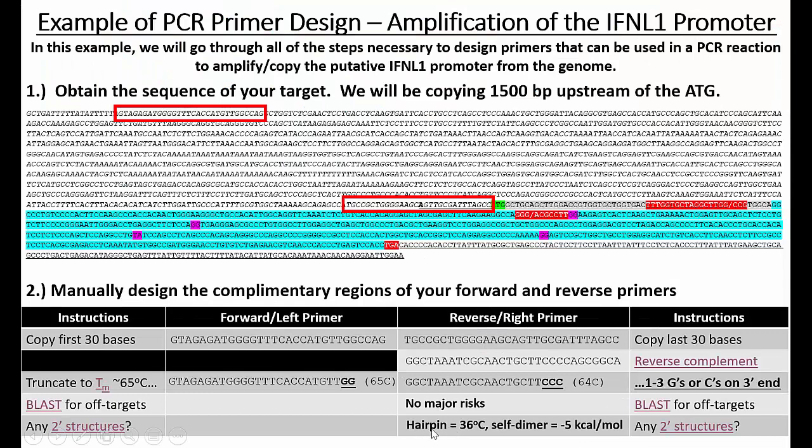And I do like to note what the TM of the strongest hairpin is, and the delta G for that strongest self-dimer, all right, just for future reference in case I want to look back at that.